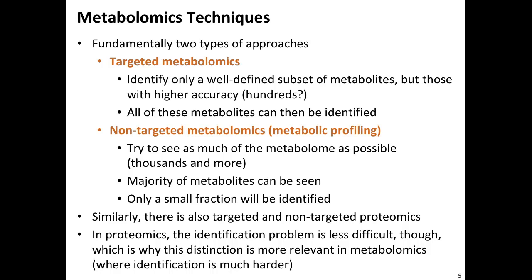If we're talking about non-targeted metabolomics, that is also called by some metabolic profiling, then we have another problem. We see lots of things all over the place, but we have basically no idea what they are. When we compare identification, and we will talk about that tomorrow morning, then metabolomics is far behind proteomics. It's just much harder to identify metabolites.